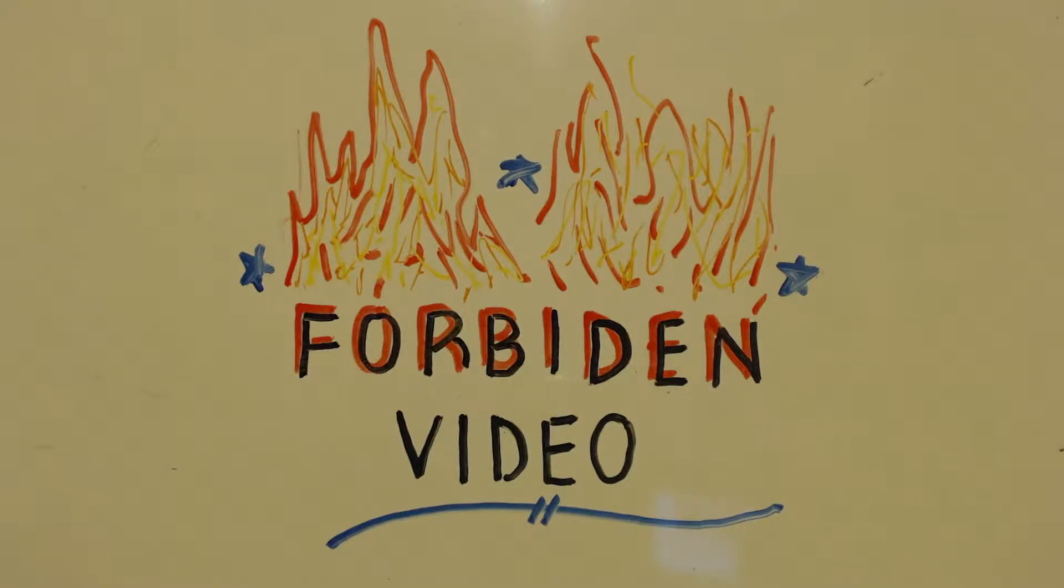This video is not intended to be imitated. No parts of it should be copied or done by you or anybody. It's just for educational and maybe entertainment purposes to watch.